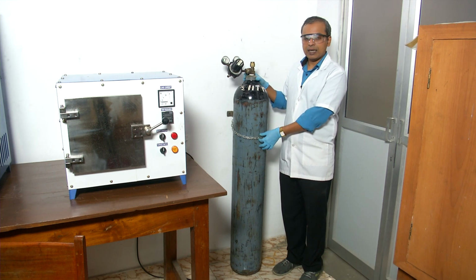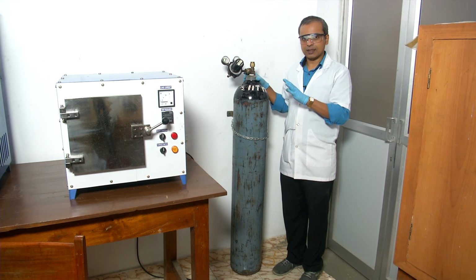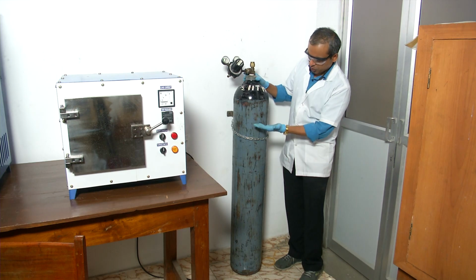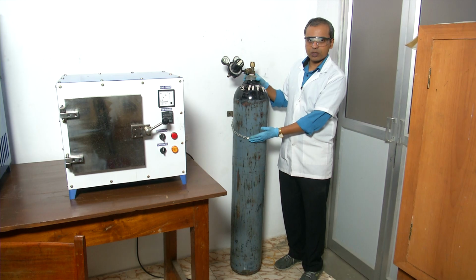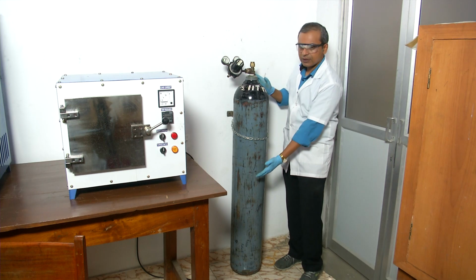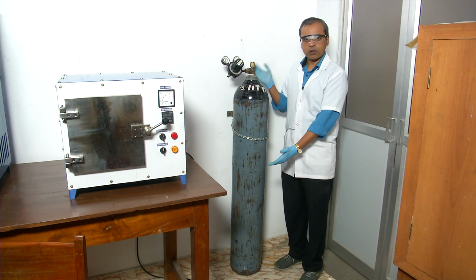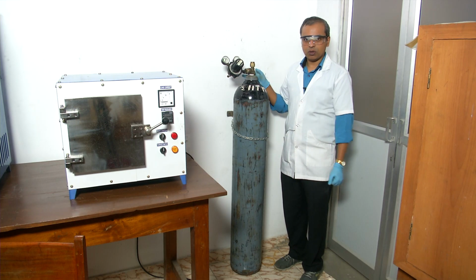Anytime you walk into a lab, if you see a gas bottle, you should see it restrained in this particular manner. It is also important to remember that it is not sufficient that you simply have a chain around the gas bottle. You should make sure that the chain is roughly about 2/3 or above, closer to maybe 3/4 of the height of the bottle. That ensures that the bottle cannot topple down. If you have the chain too low, then you have actually not served the safety purpose, because the bottle can still fall down. Only if it is reasonably high, the bottle will not fall down.